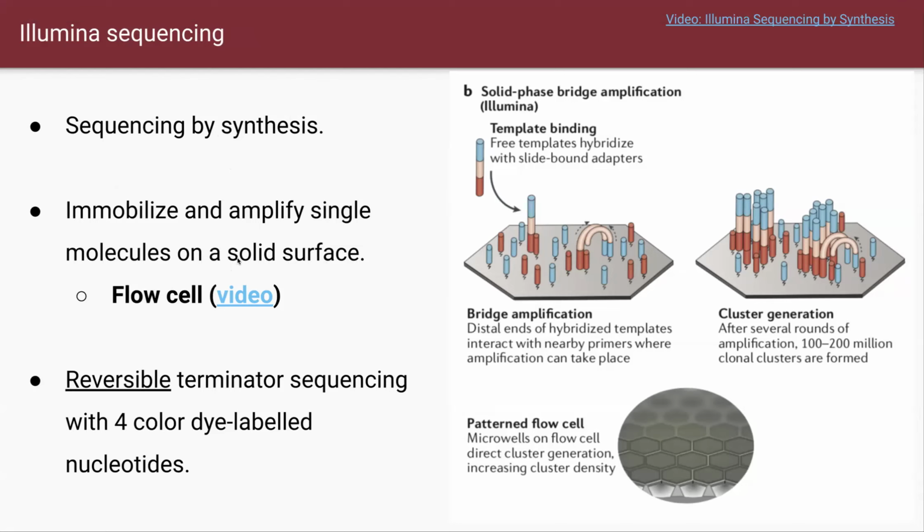And onto this solid surface, you put the library into those areas. So this is one very tiny spot of the flow cell. Onto this flow cell, you put the library onto the priming station, to these individual spots we call priming stations. Then you put the library like in here, then you put in here. We'll get to that later, but a short explanation for now.